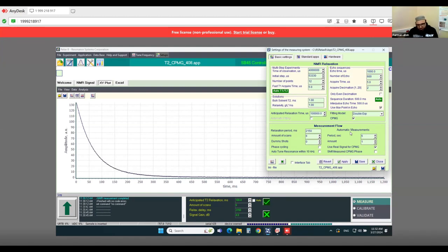You can also use, I will further show you. So I will apply here, and let's see what happened.